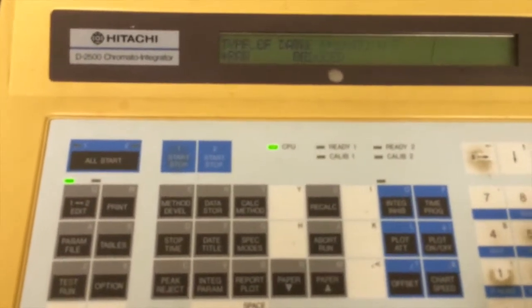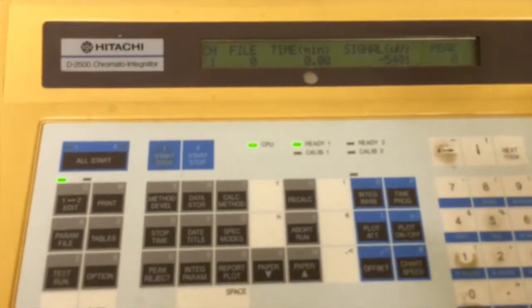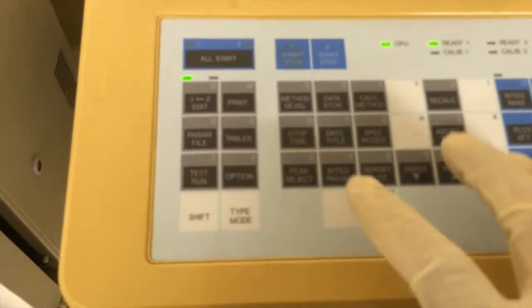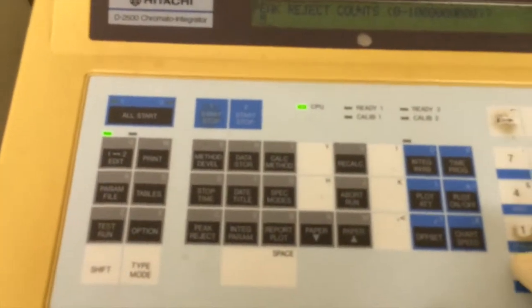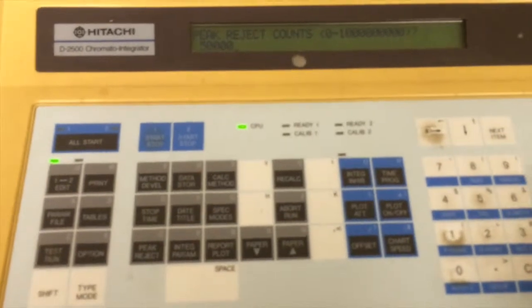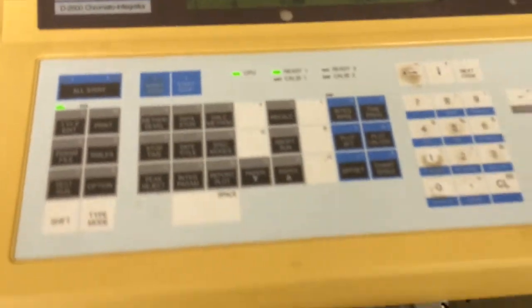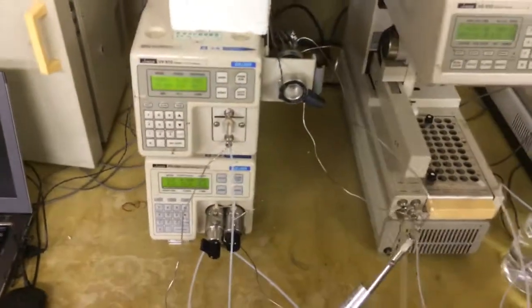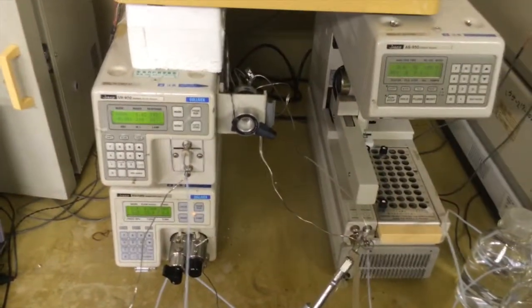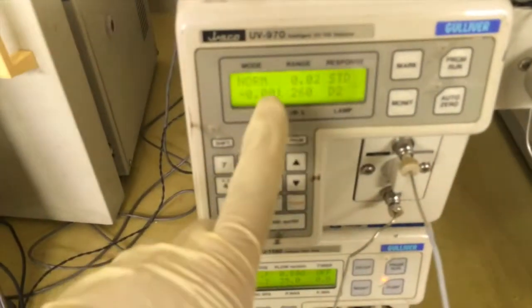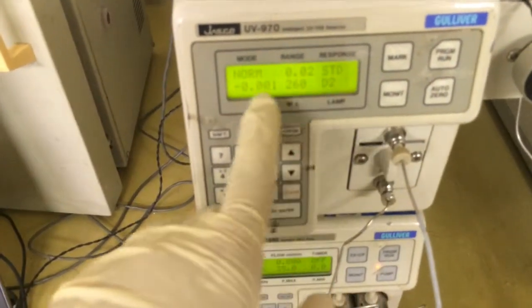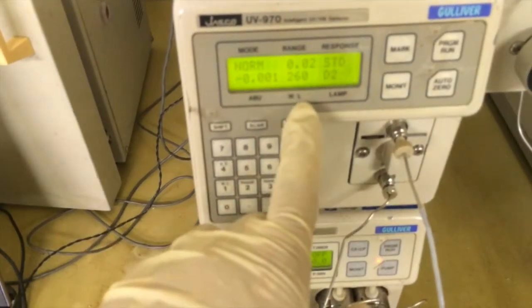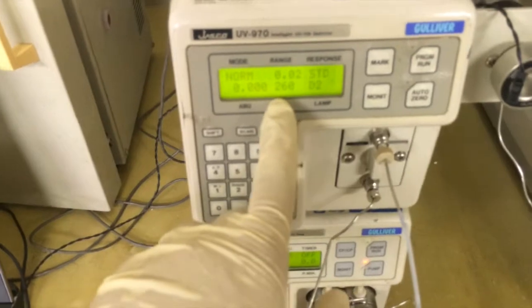Okay, finish. Now setting the peak reject - I think 50,000 is enough. Now establishing. In this process, we need 30 minutes to get the UV absorbance to normal and also set the wavelength. I set 260.